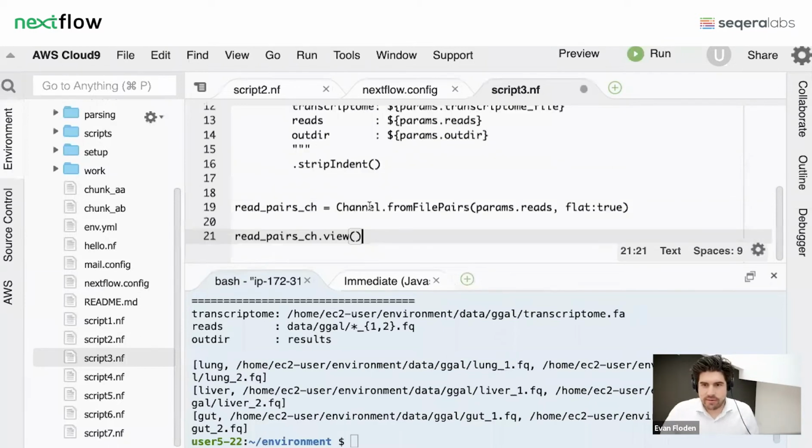Okay, we can jump in now and see the solution to that. On the example there, you should be able to see the examples of the answers here. So one way of doing this in terms of creating a channel, you've got 2 options. One of them, in this case where we're using this assignment here, we're saying read pairs equals, and then we're creating this.